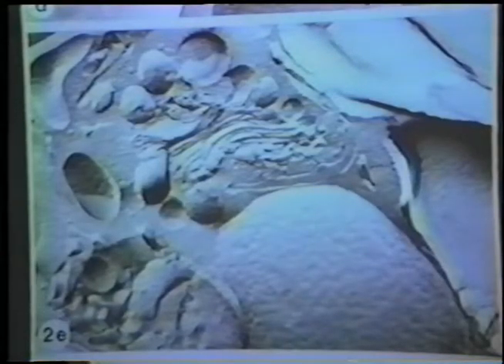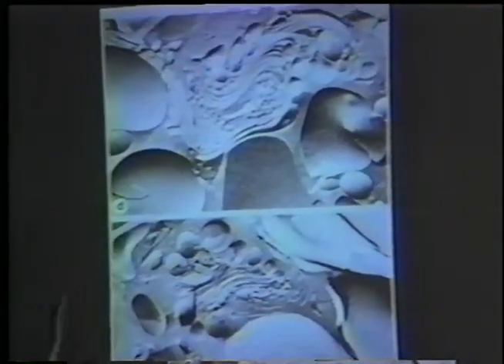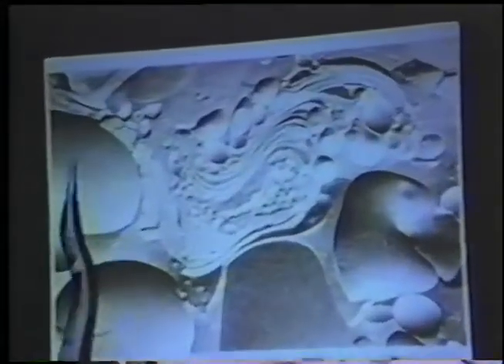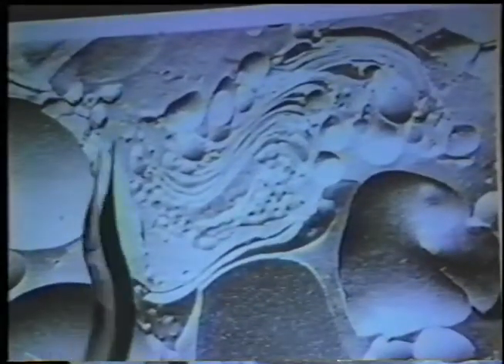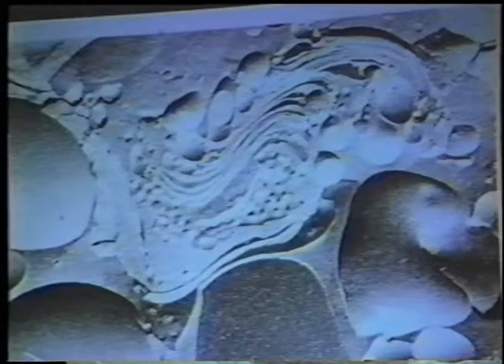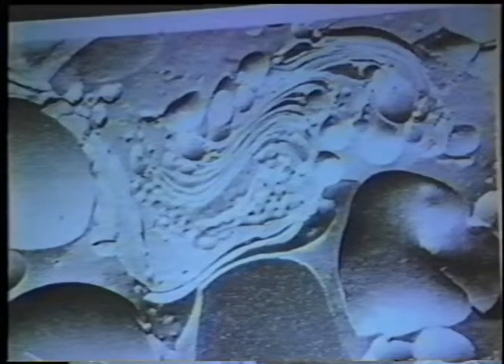This is the marine brown alga Pelvetia fastigiata. It was on your coast here. And this cell was very well preserved. You can see the smooth membrane faces on the many vesicles in the cytoplasm and the nicely preserved Golgi, the fenestrae and all the associated vesicles. This cell was not so well preserved. It's not so awful you couldn't get any information from it, but you can see that the membranes are a bit lumpy, and the cytoplasm is not as smooth and uniform as it is in this case.